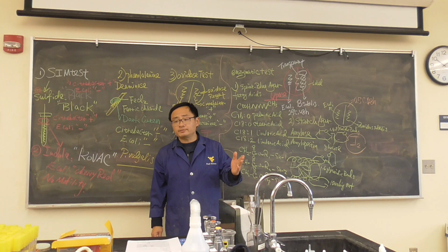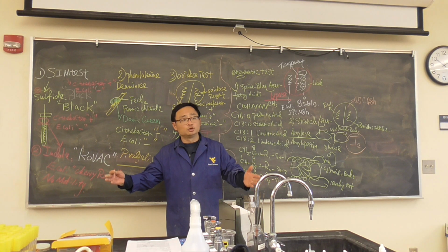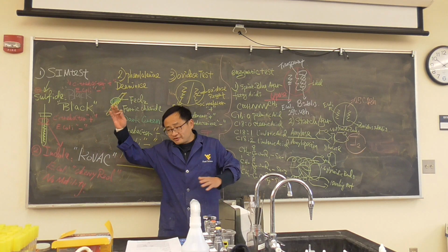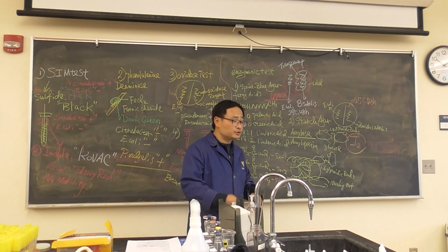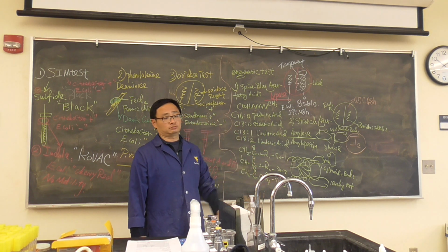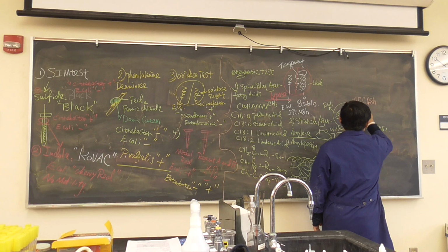Most of the time it's a brownish color, but not really. It depends on how long the starch is. If the starch has like 10, 12 units, usually it's brownish color. If it's more than that, let's say like 24, 25, usually it's red. But basically we say it's a brownish color. So after incubation, we need to pour the iodine reagent.